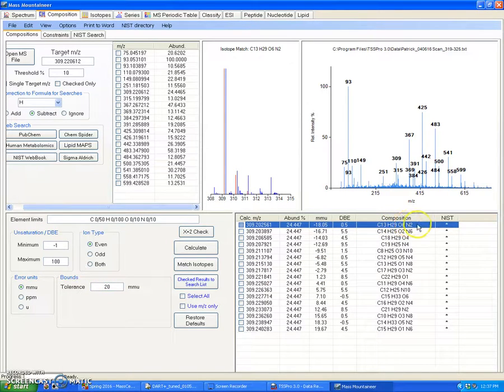Also, these elemental compositions are completely random, so it's based off of your intuition to select the appropriate assignment. In this case, because this was on the dollar bill, this is a ubiquitous compound, and it's not going to be some exotic synthetic compound that you may have created.